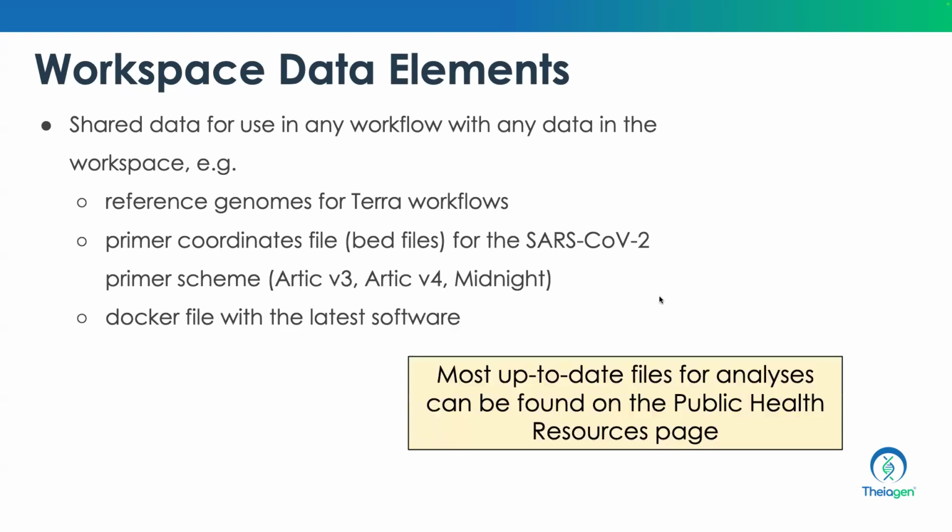You know, in general, you want these to be the most up-to-date files for analysis within that particular workspace. So assume that within the same workspace, you do undertake analysis for different pathogens. So you want to have a reference. Again, remembering that in public health, it's often good practice to have standardized protocols.